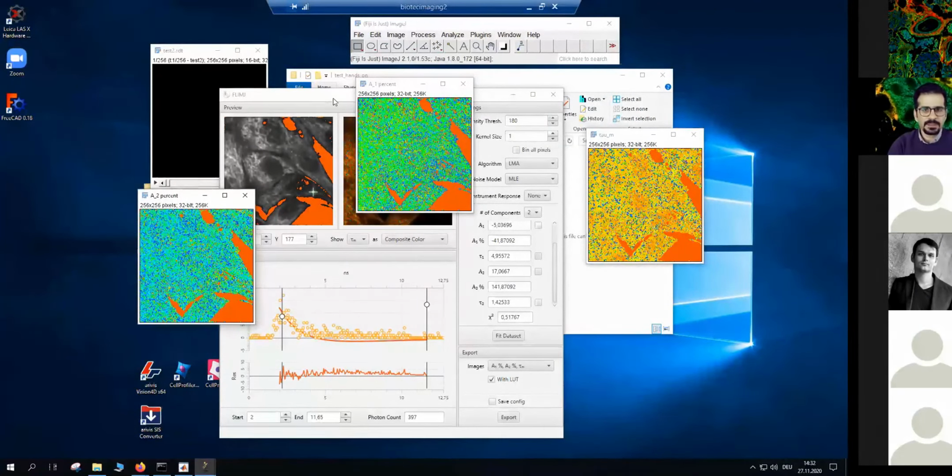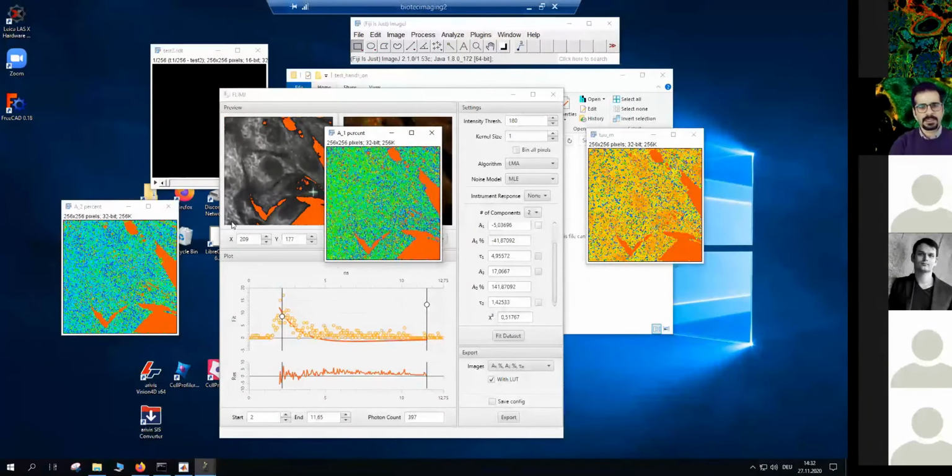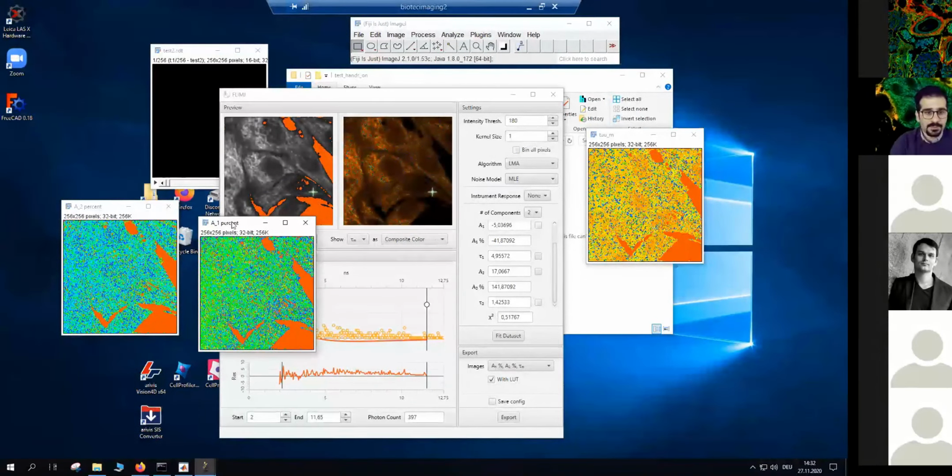And will look amazing, but the good thing, as I said for the SLIM curve as well, is that we can use this data if later on we would like to do any further analysis like segmentation, measurements, and finding out where the nuclei and the cytoplasm are, and if we have time lapses or time points, measurements for different kinds of experiments, like studying the effects of drugs on your cells or different components on your cells.